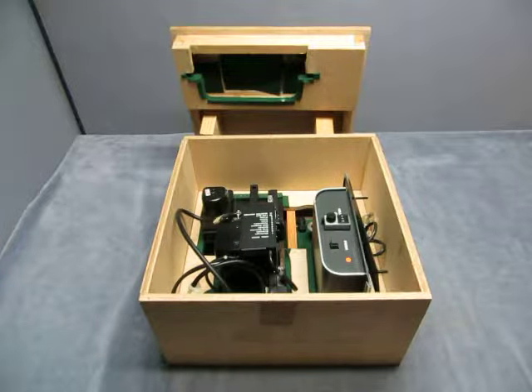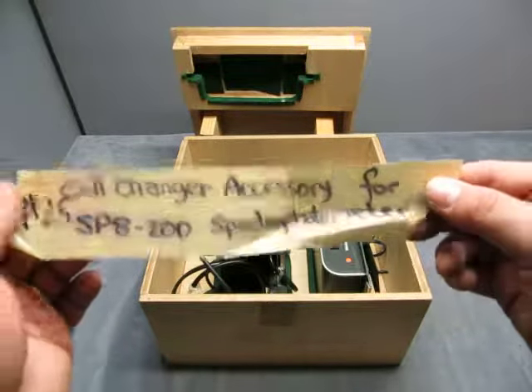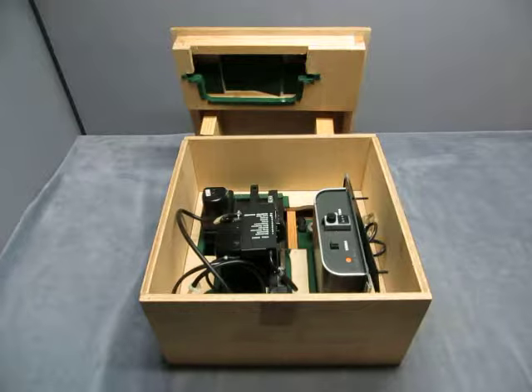For sale we have a wood box with some stuff inside it. I believe this is the cell changer accessory for an SP8 200 spectrometer — that's why I think that. That was what was with it, and that's all I have for information.